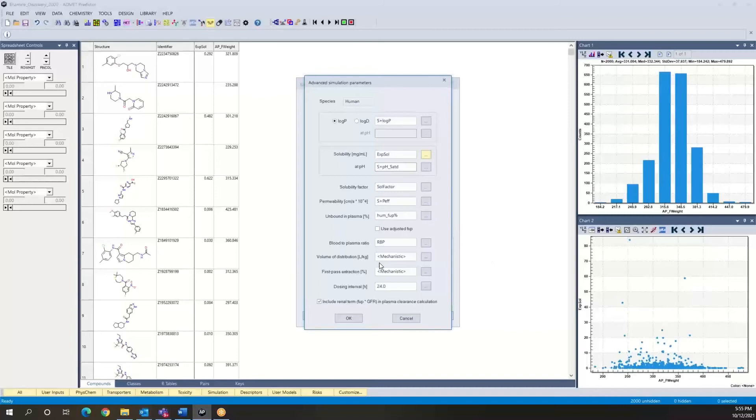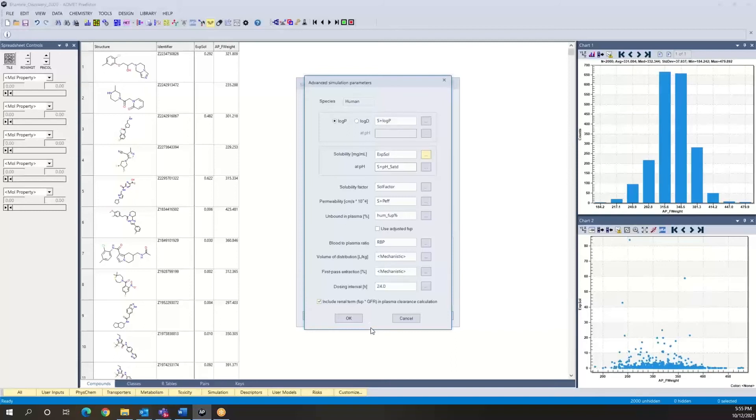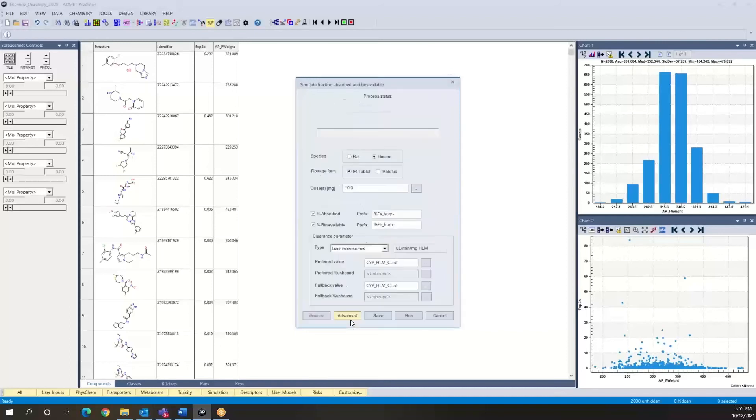And now you could do this for any other property that is involved in the HTPK simulation. So if you had experimental values for permeability or for the blood to plasma ratio or really any other parameter that is involved in the simulation, then you could substitute it. So again, instead of using the model, it could use your experimental values. You click OK. And now we're going to run using these experimental values.